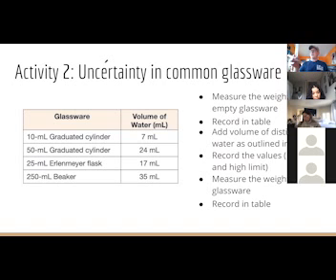So I would probably estimate for this that my lowest could possibly be like 23.8 maybe, and the maximum could be maybe 24.2, but it's not going to be much more than that, because I can easily tell whether or not the meniscus is less than halfway or more than halfway in between those two marks. So that would be my range for this.